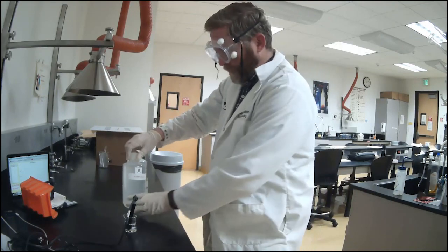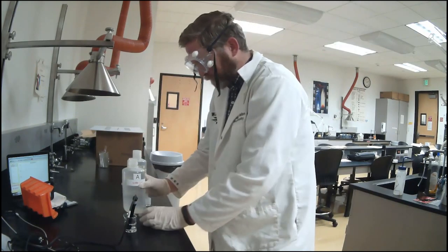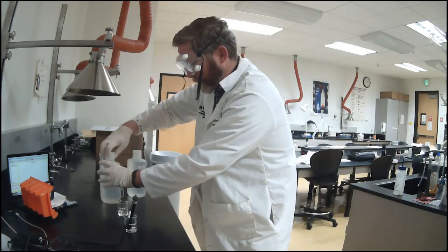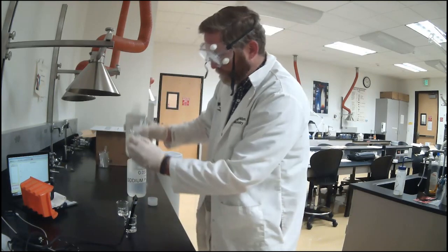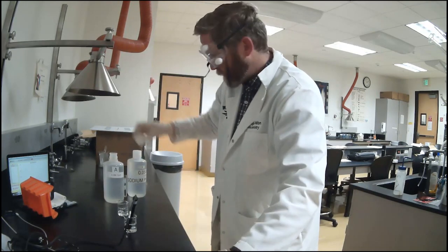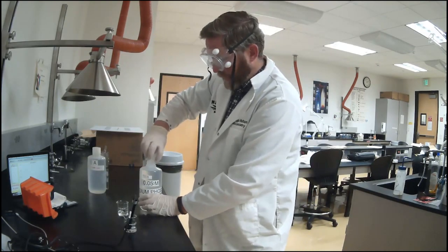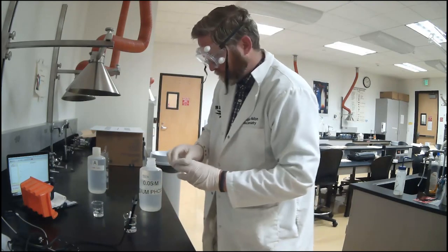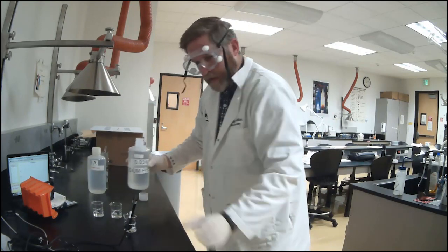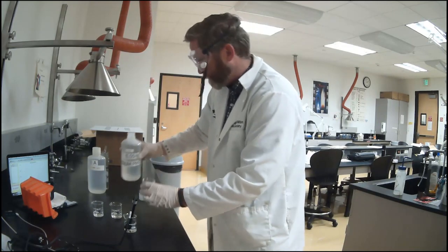Then we're going to take a solution A of calcium chloride and put it in beaker labeled A. And then we're going to put a little bit of A into beaker C. And then we're going to put this sodium phosphate into beaker B. And then again the same into beaker C, which will be our combination mixture.